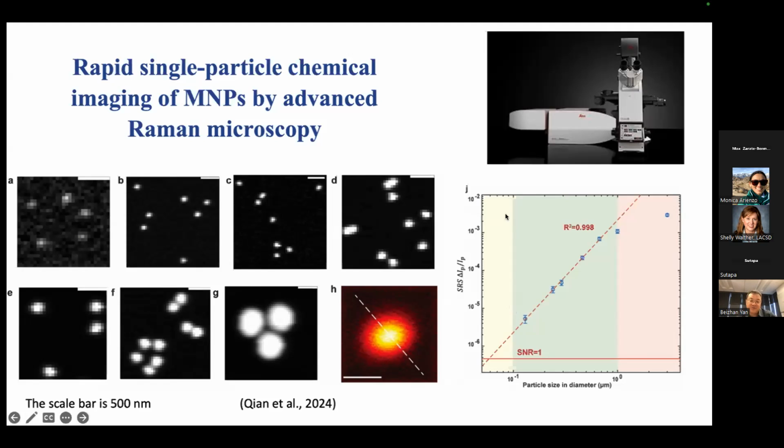One thing that even surprised me is the Raman intensity, shown on the y-axis, has a very good relationship with particle diameter. You can clearly see a linear relationship up until 1 micron. Which means when we see the Raman signals, we can figure out not only the spatial location of these particles based on the laser movement, but also their particle size based on the intensity, which is really exciting for us.